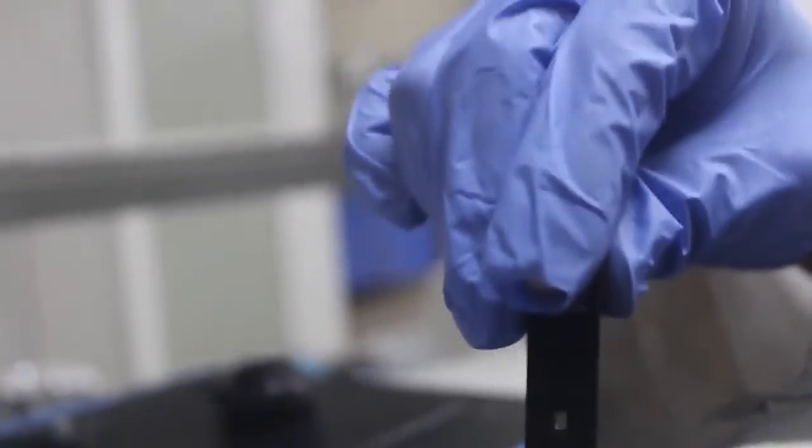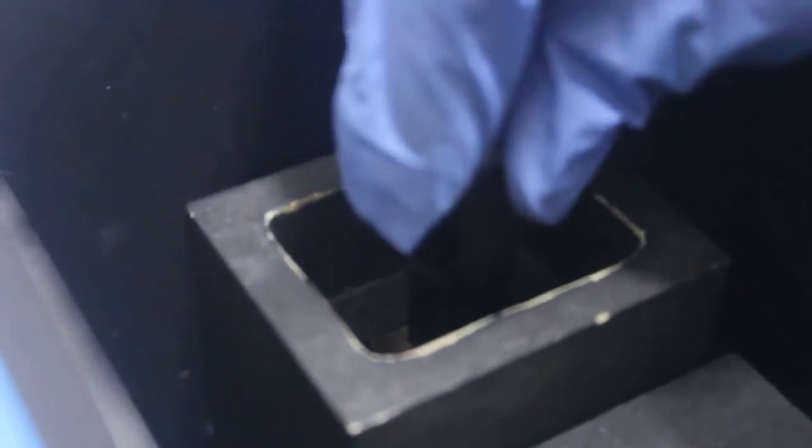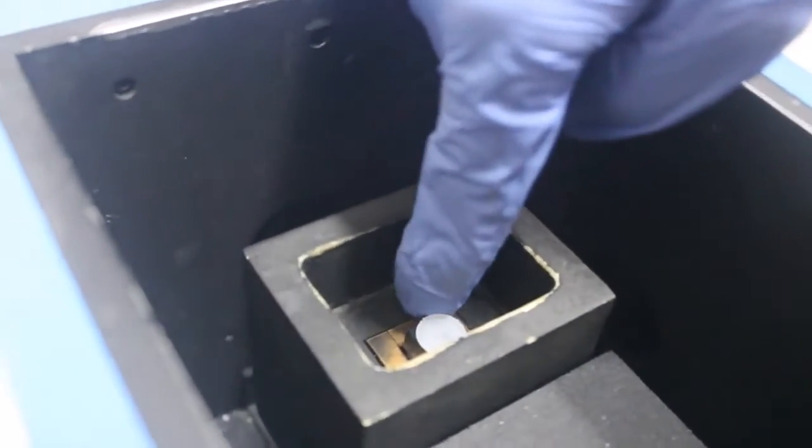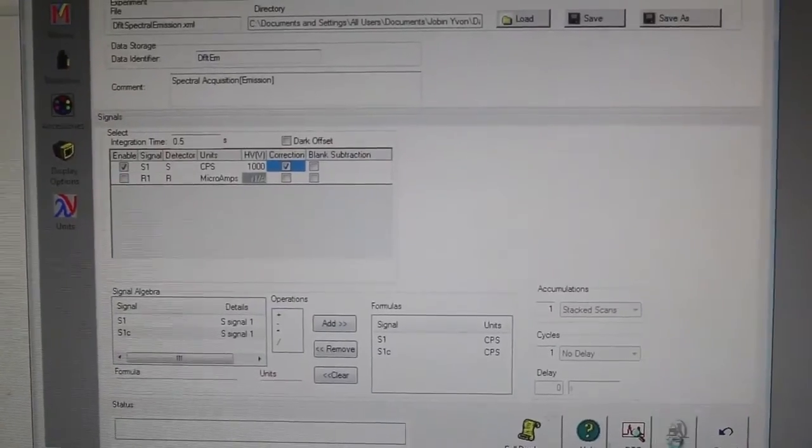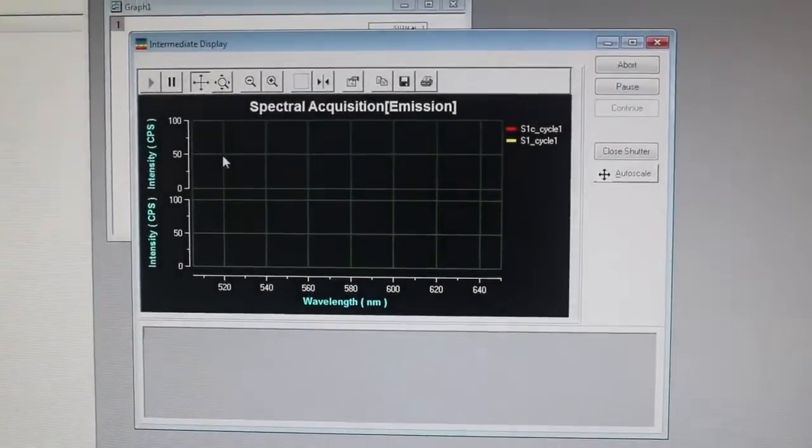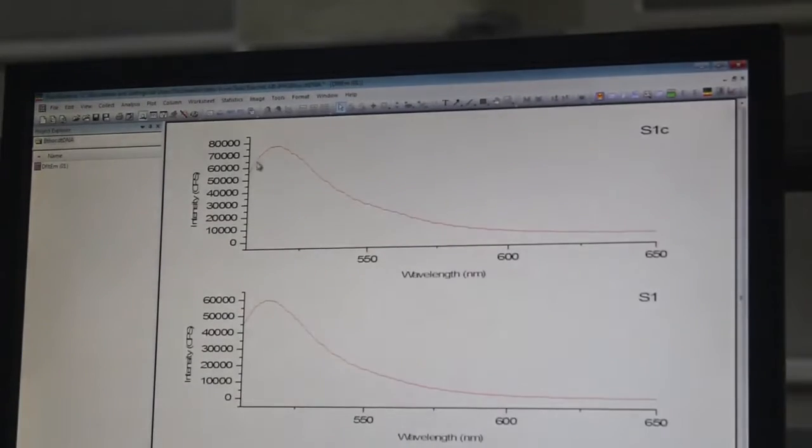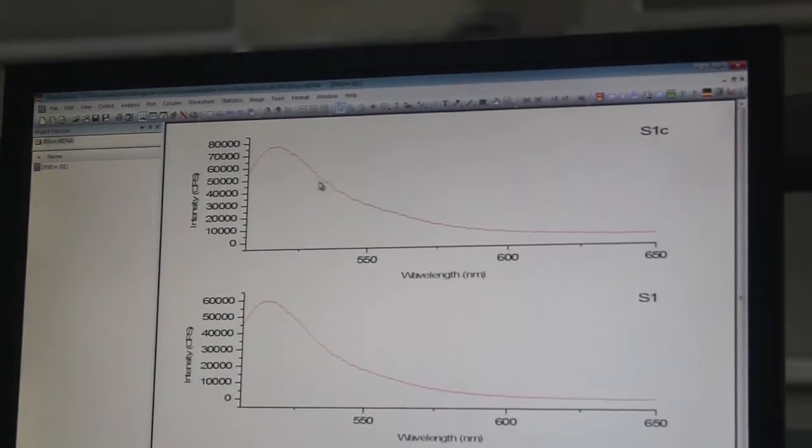Now we're going to put this cuvette along with the sample inside the cuvette holder. Light is coming through this way, emission is collecting through this way, so we have cuvette windows open towards this and this side. We click on this run button—it will start acquiring the spectra. This is the emission profile of our donor light which is attached to the DNA.